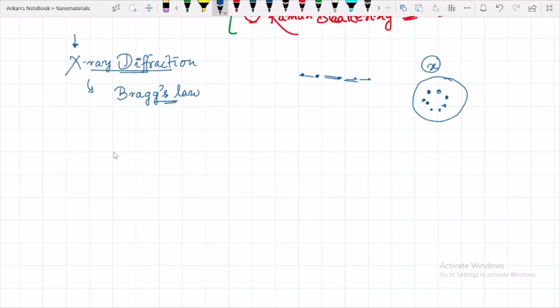So he obtained diffraction points when he used X-rays with the diffracting element provided by the lattice planes. But these diffracting elements were different from the visible light diffraction element, because he used the planes of diffraction rather than a single diffracting element.